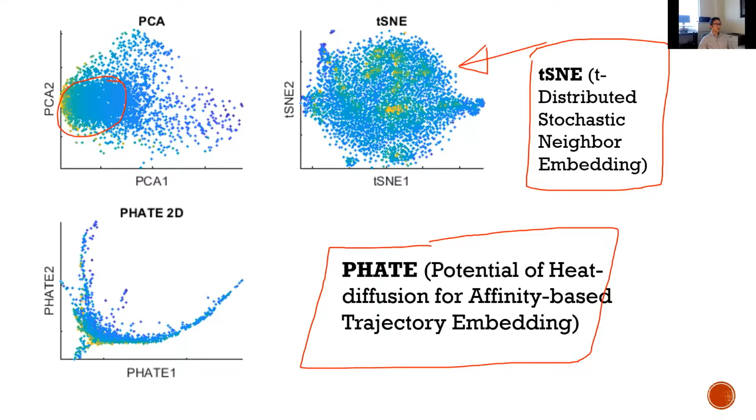It tells you the elongated structure among the cells. So some of the cells have a very special profile compared to the majority of the other cell types, and it creates this one arm, which you cannot see for those subset of cells in tSNE or PCA.